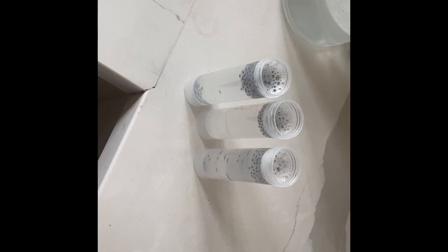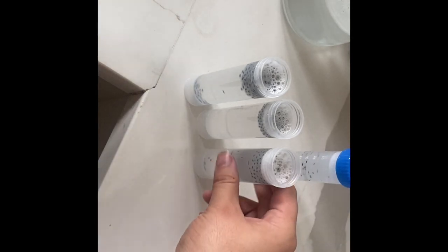Now we're going to go ahead and close these up. If you have a shaker, go ahead and put these on a shaker now for that 20 minutes. If you don't, shake them every 5 minutes and you'll be fine too. So fast forward and let's go induct these on plates.